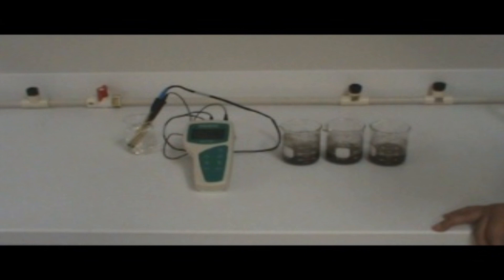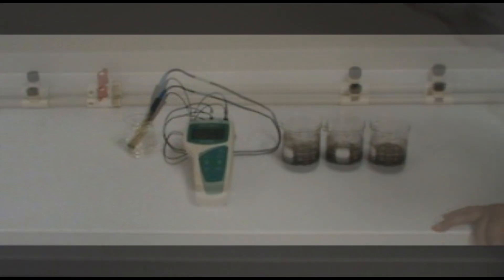you will then require your pH meter, double junction electrode, and ATC probe. Make sure that the meter and electrode are properly calibrated in accordance with the procedure listed in the meter's manual. For time purposes, the pH meter and electrode being used have already been calibrated.